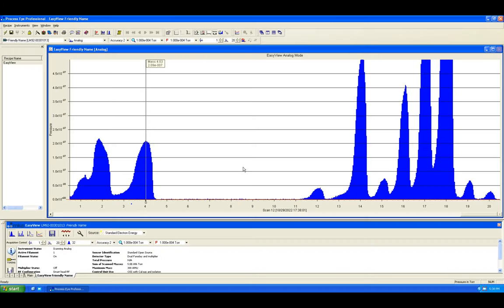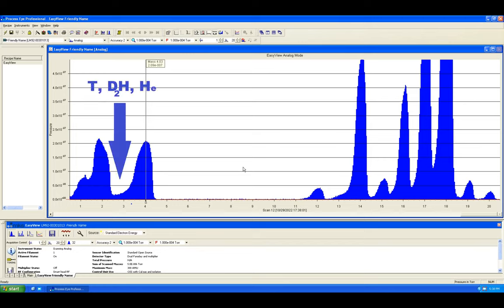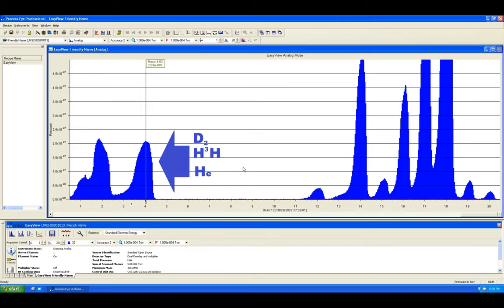But I would probably get a peak at about mass 2 for mono-deuterium and dihydrogen, another peak at mass 3 for mono-tritium or deuterium and hydrogen or helium-3 alone, and another peak at mass 4 for di-deuterium or tritium and hydrogen or helium-4 alone.